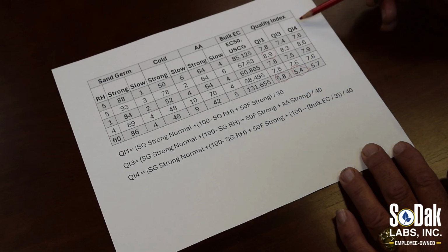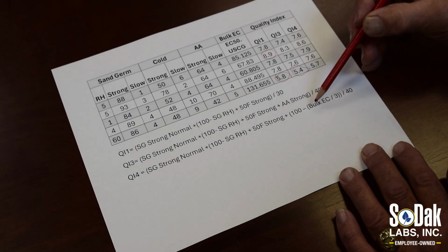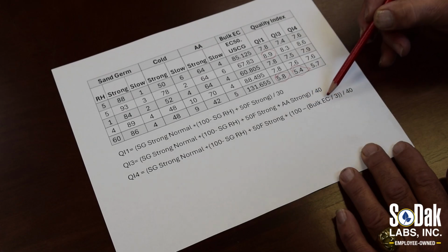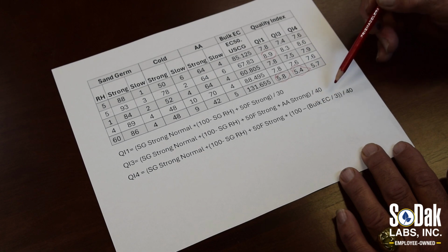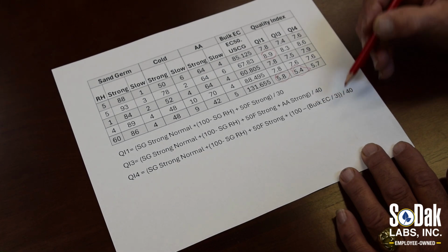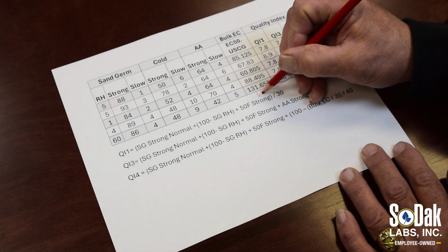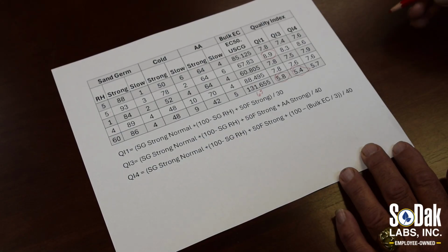And the 4th is when we use bulk EC. So on bulk EC, we have to do some manipulation or conversion of the data, and we spent a little time looking at this. In bulk EC, we think 65 is acceptable. You know, 30 is excellent, but 65 is acceptable.